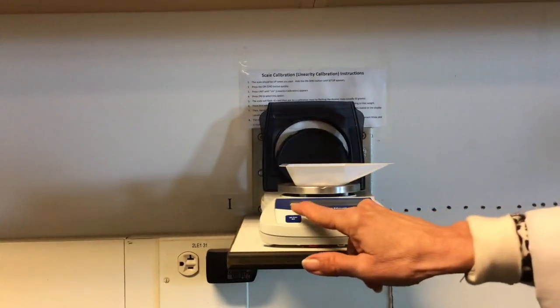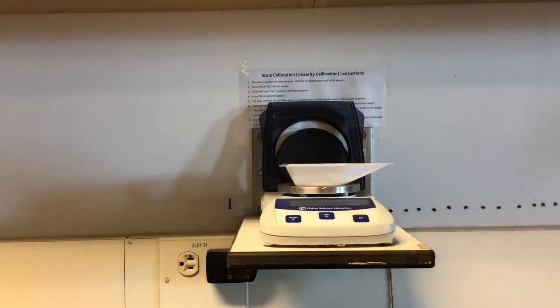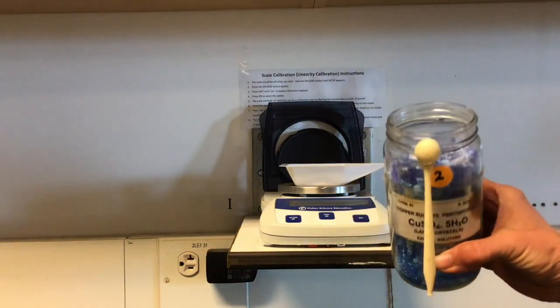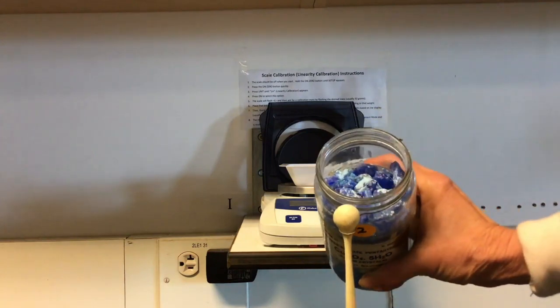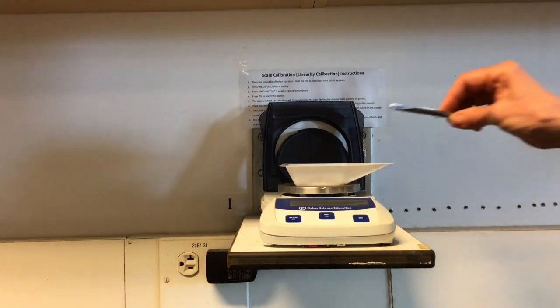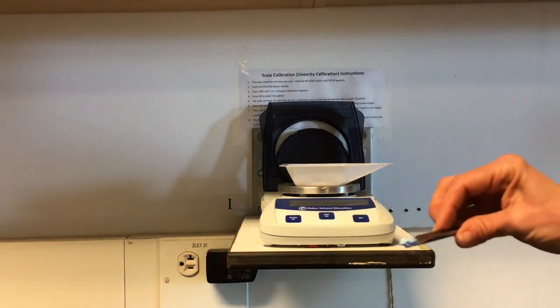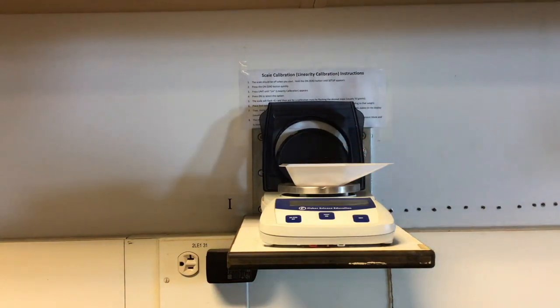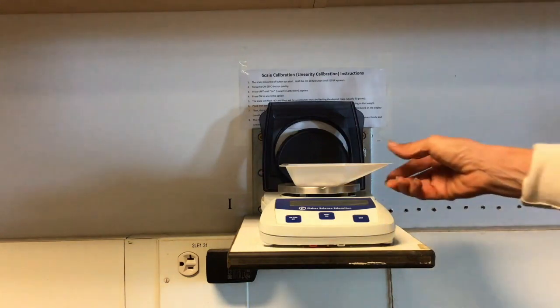I'm going to go ahead and tare my weighing boat by hitting the 0 key. Once that says 0, I have my crystals of copper sulfate pentahydrate that you can see here. They're very large crystals inside. I'm going to take out one of the crystals from here that's about the size of a pea, and I will get the mass of that. So this copper sulfate pentahydrate crystal weighs 0.864 grams.